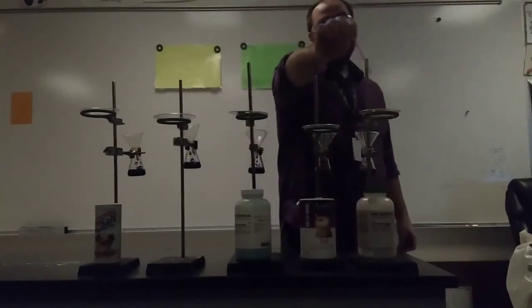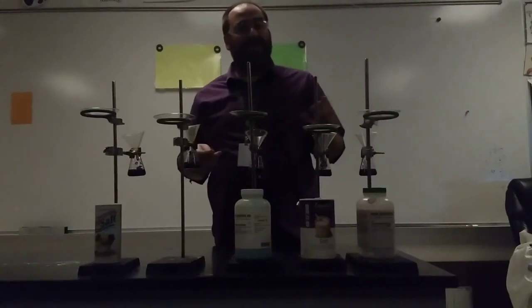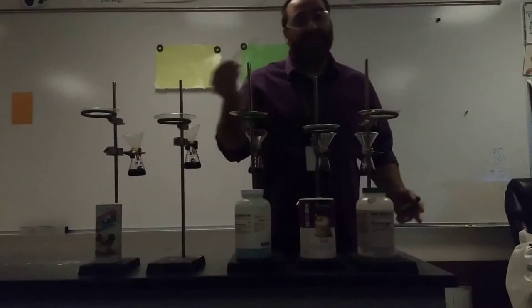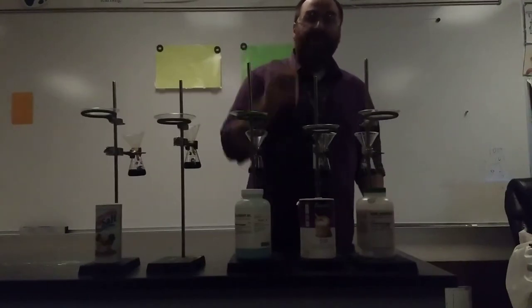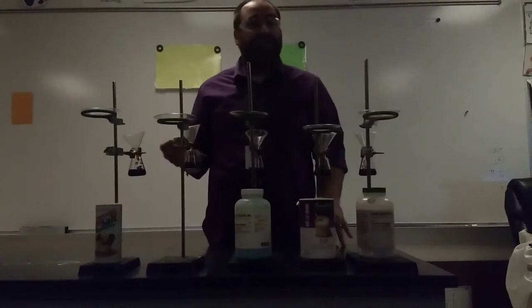Over here on the very right we have strontium chloride. Strontium chloride is a strontium atom, which is a metal, attached to a chlorine atom, which is a non-metal, specifically two chlorine atoms. Right here is table salt, the salt you're mostly familiar with. Table salt is sodium chloride.